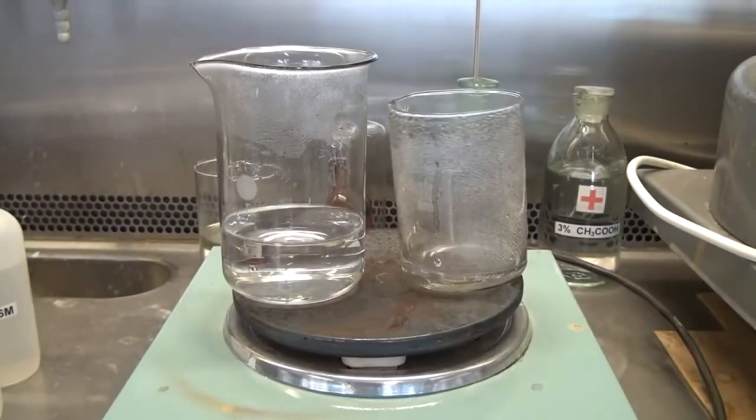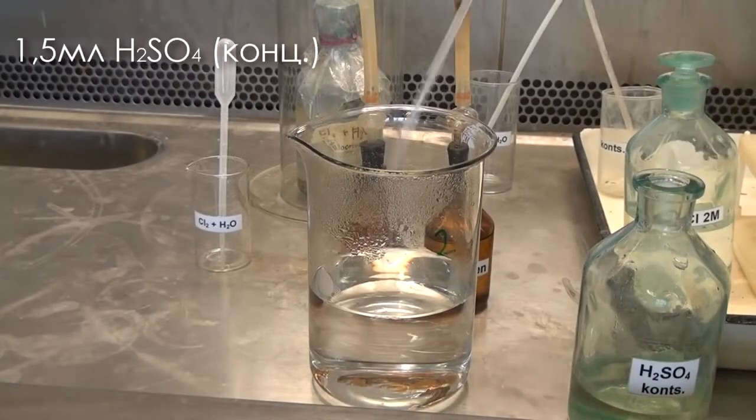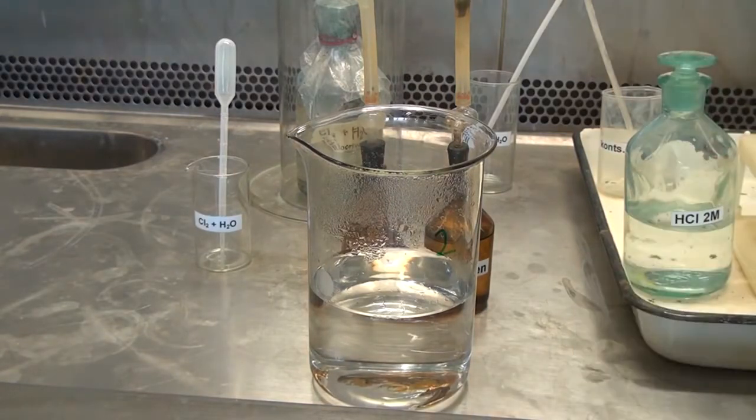Once the potassium iodate is fully dissolved, add into the beaker 1.5 milliliters of concentrated sulfuric acid. Thereafter we bring the solution up to a volume of about 1.3 liters.